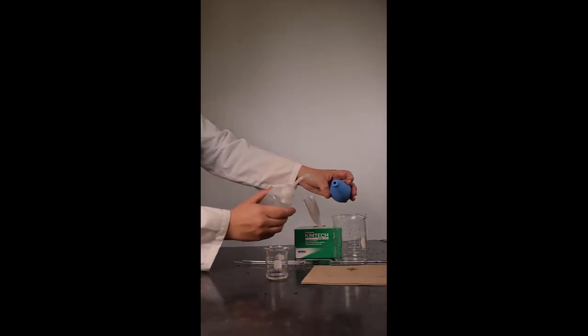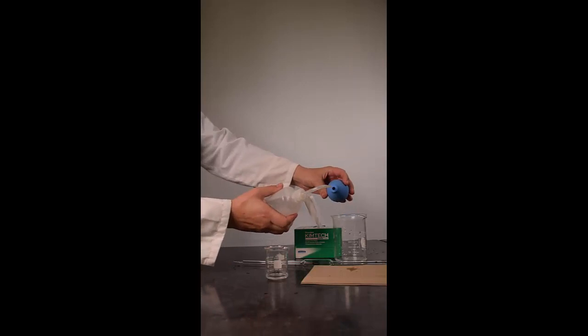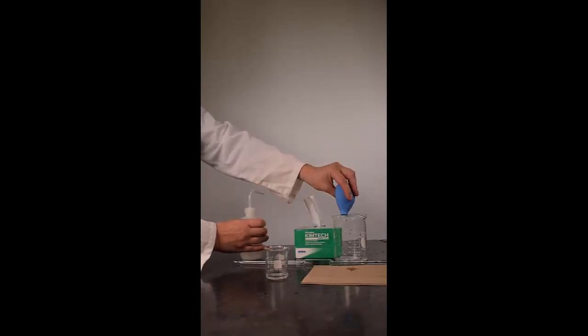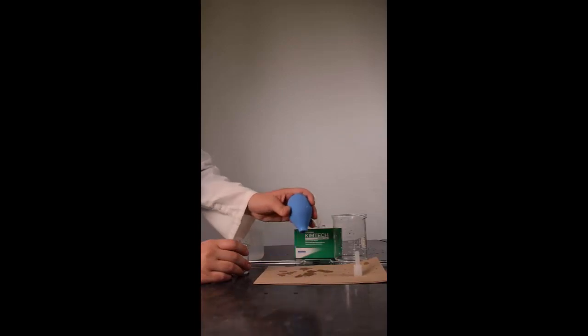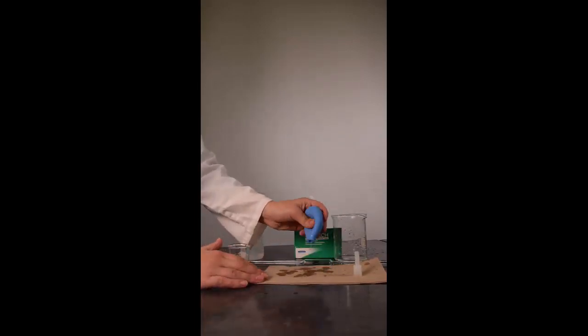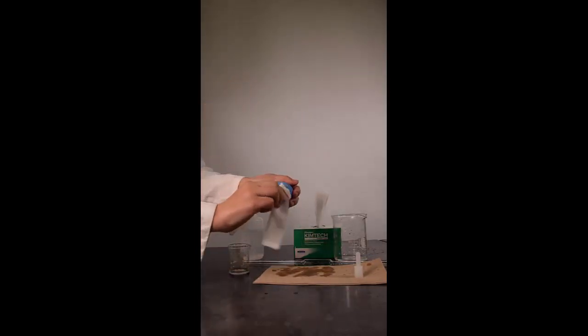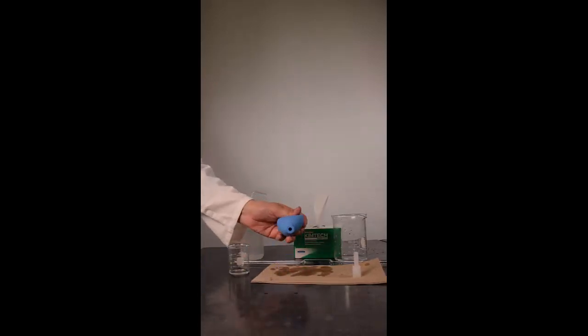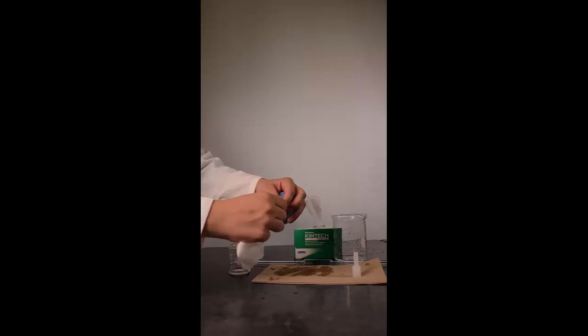Shake and squeeze the bulb to remove as much moisture as possible. Continue to squeeze and shake the bulb until no water comes out of the bulb.